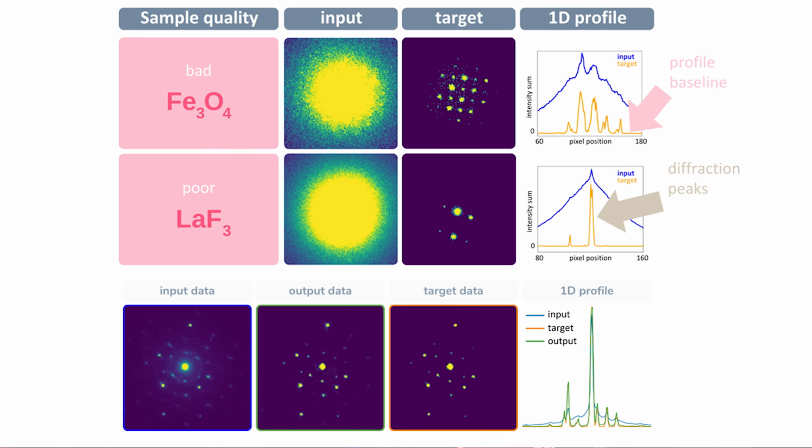And to get this, I actually had to apply several deterministic operations. It was a combination of morphological operations and so on, to produce it. And it took me a lot of time. And it was not automatic. I had to look at the data to obtain this. And this is something that no one wants to do because it takes a lot of time. And for each sample, you need to do it over and over again. So I did this for various samples. And that's how I obtained the data that are suitable to train a neural network.